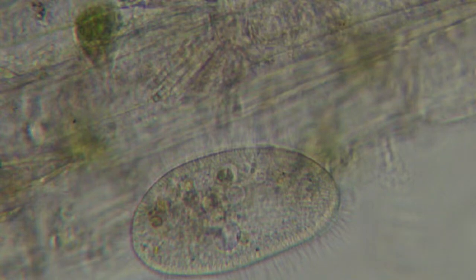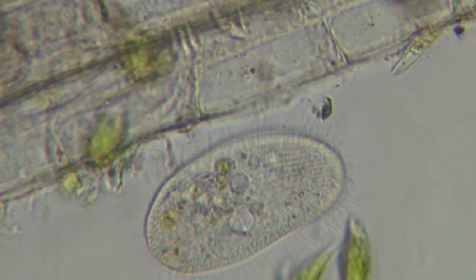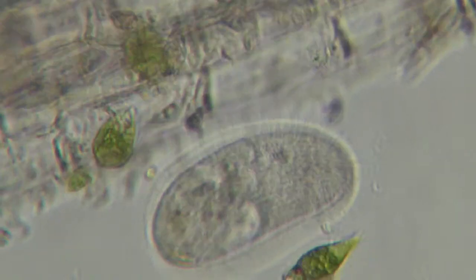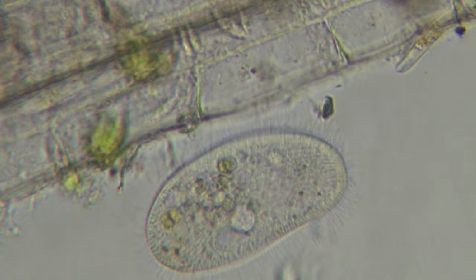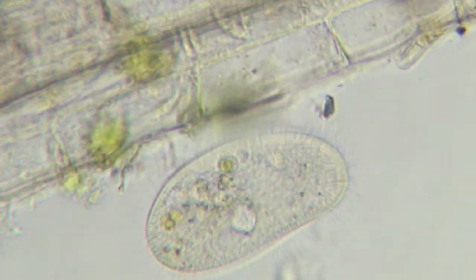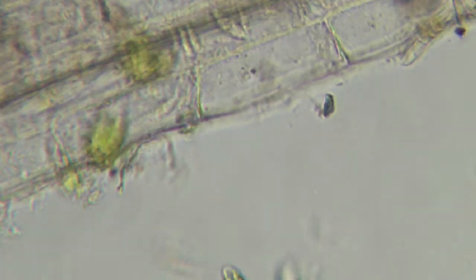Oh, there's another one next to it. Look at that. There's a cilia just hanging out. Look at those long cilia there. Very bristly. I have to contrast it a bit so you see it better. Oh, now it's going to move again. It's taking a break. See the striations? And the cilia beating like crazy. You can see the cilia better when I darken it a bit, get more contrast.